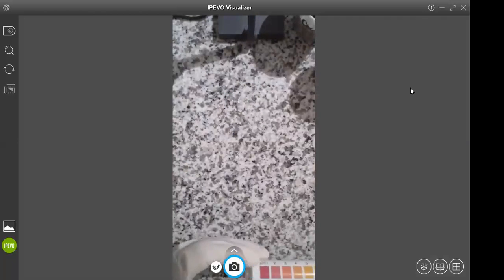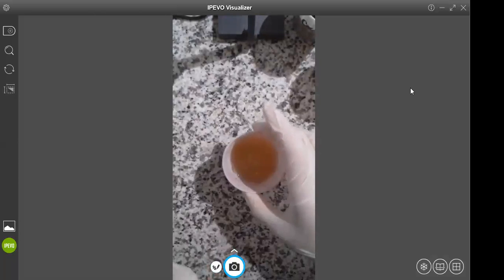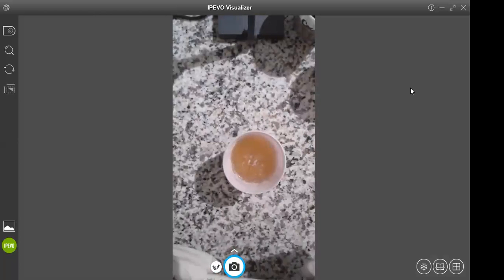Now we're going to try solution number 5. It's going to be something a little wonky. I took Tums and dissolved them in hot water. So this is Tums, right? Usually you eat them when your stomach is not feeling well because you have acid reflux. Thinking that this is something that combats acid, maybe make your predictions based off of that.